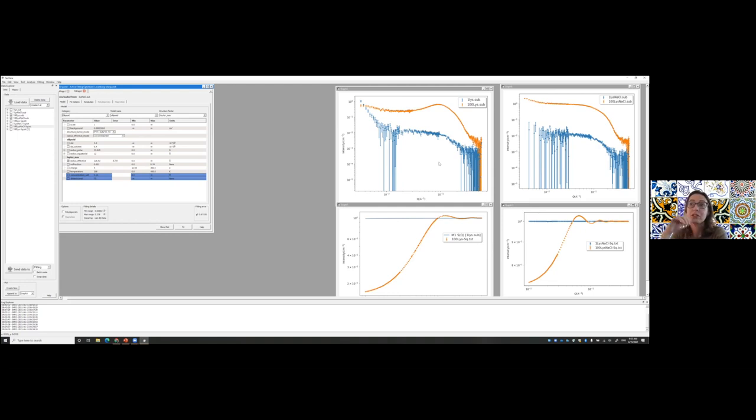And then the actual concentration that the neutrons see is not the same. So that's not unusual to see. And it's one of the reasons that when I'm measuring scattering data, especially at higher concentrations, I measure the concentration before and after my SANS experiment. So remember, neutrons are non-destructive, so you can recover your sample and measure the concentration after your experiment, just to make sure that there was no settling, that your concentration hasn't changed drastically.